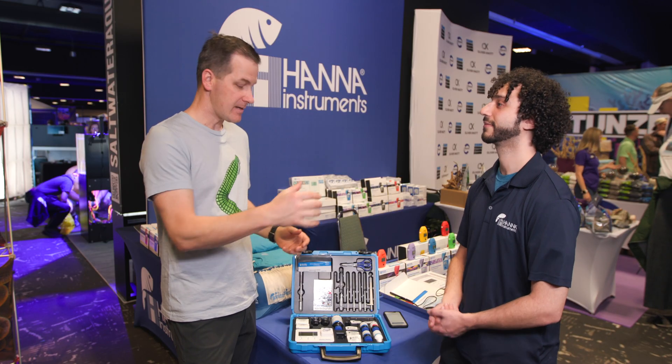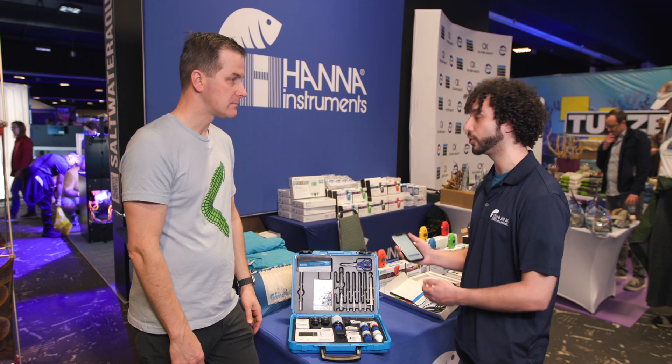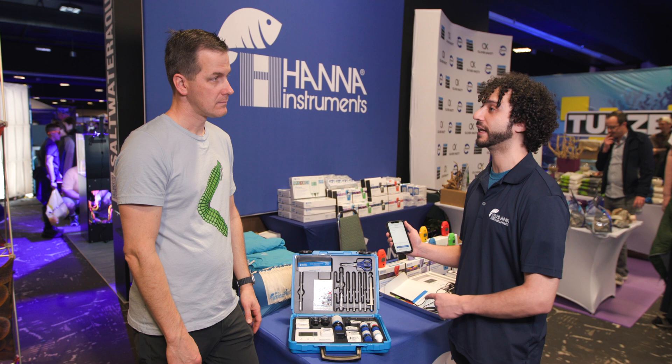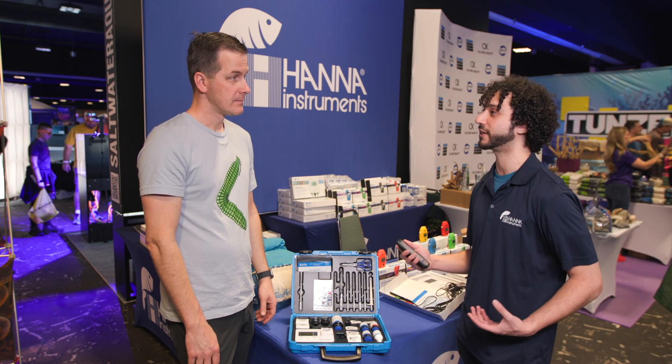So we're testing, logging, and it's an easy way to review your data and work with your controller. In the app you can pick two parameters and graph them against each other — for example, as alkalinity increases, what effect does that have on phosphate or nitrate? You can do real analysis if you want to get more scientific.